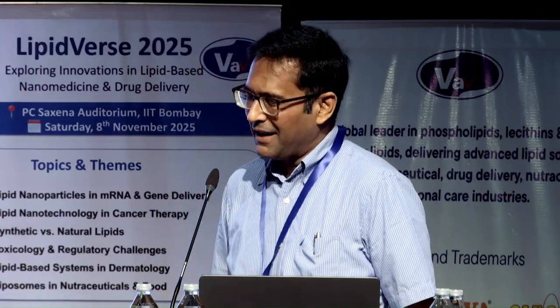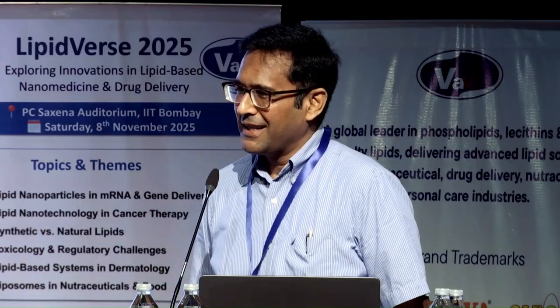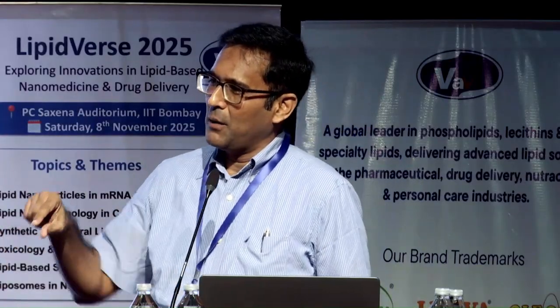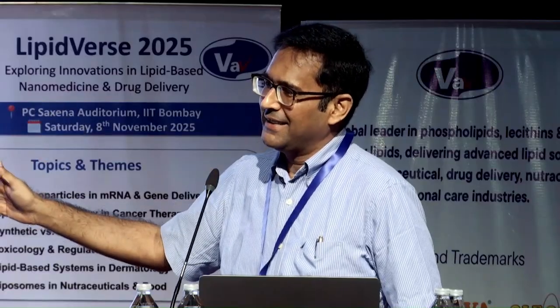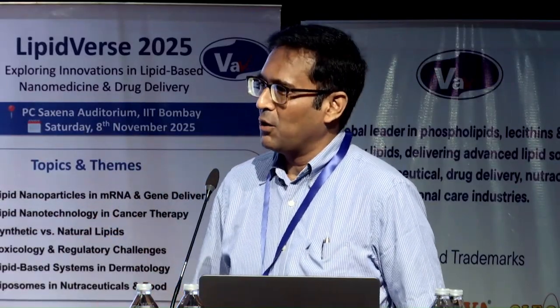You're absolutely right. We have worried about it a lot. We ensure that there's nothing coming out after we make the packed bed. We keep flowing the liquid, take that, and put it in our DLS to see if we are seeing anything. We do SEM, TEMs. But you are absolutely right, that's the worry that we always have.